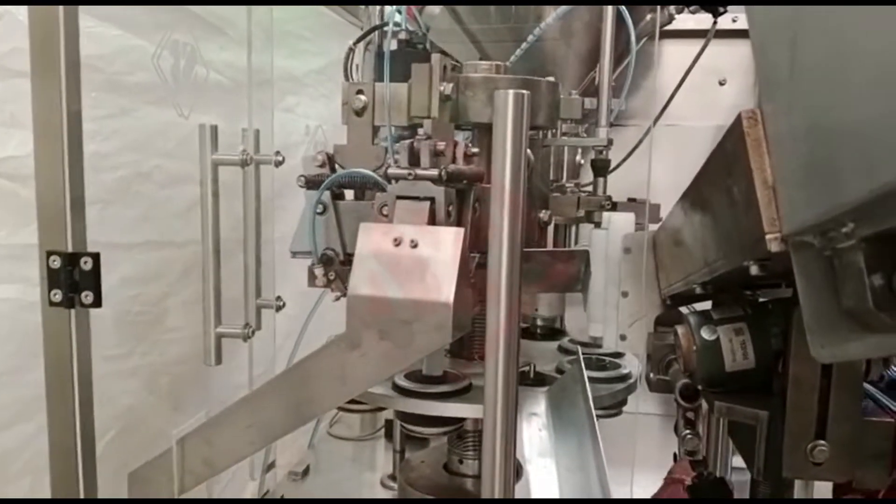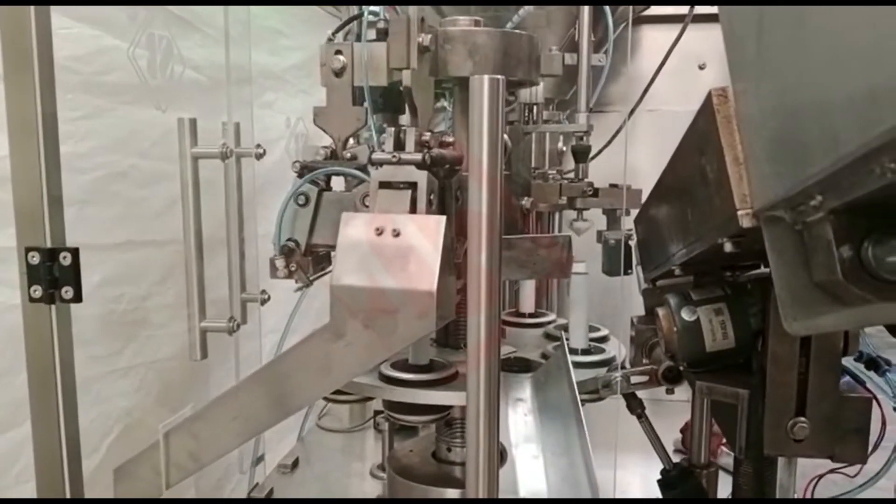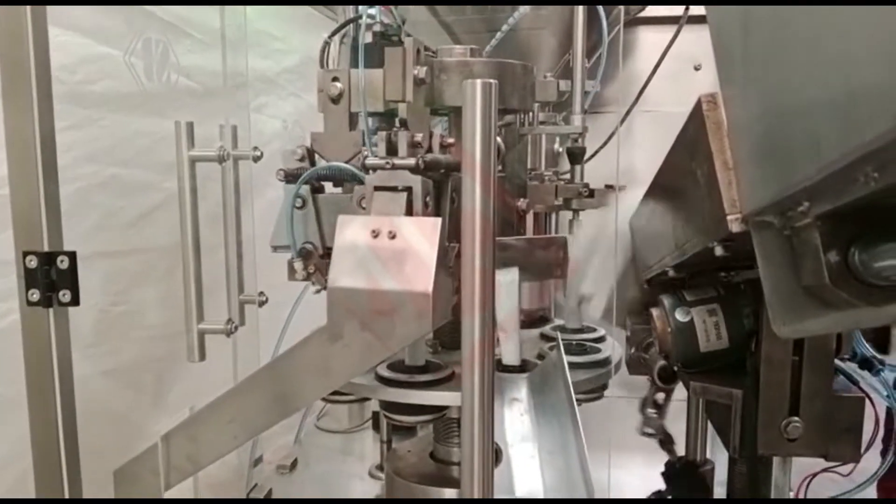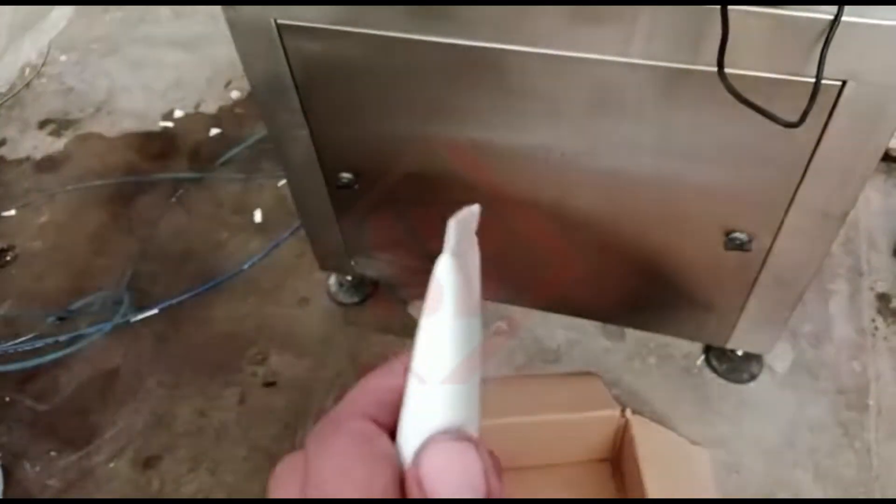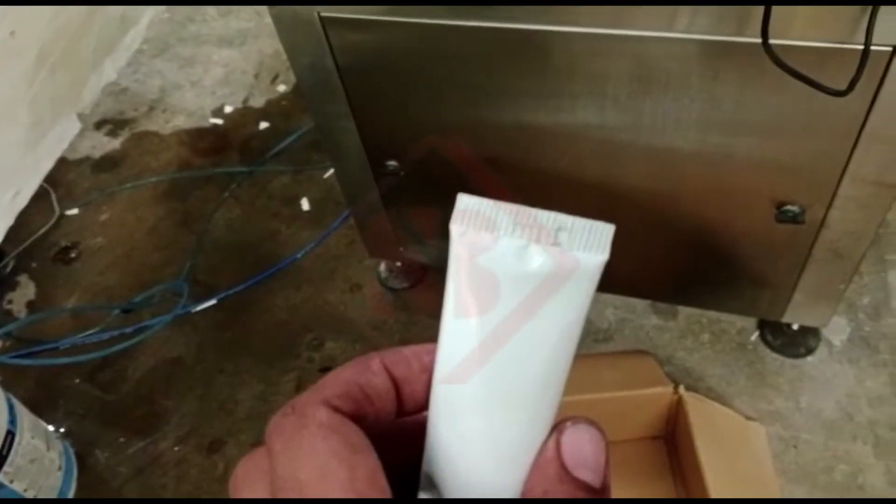Tube filling sealing machines come in various sizes and configurations to accommodate different tube sizes, production volumes, and specific industry requirements. They can be fully automatic, semi-automatic, or manually operated, depending on the level of automation needed for the production process.